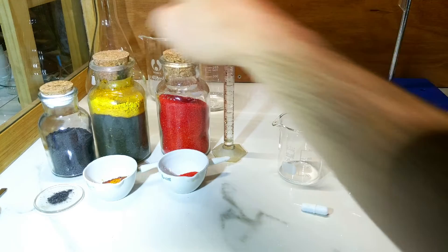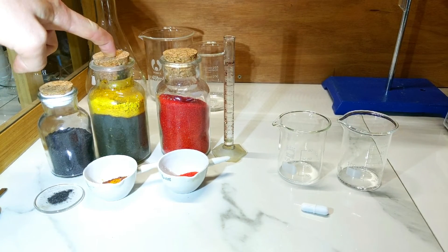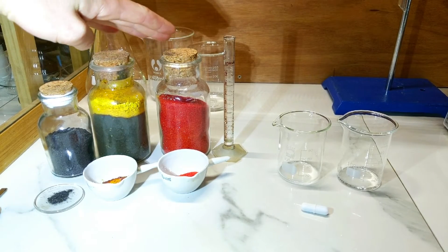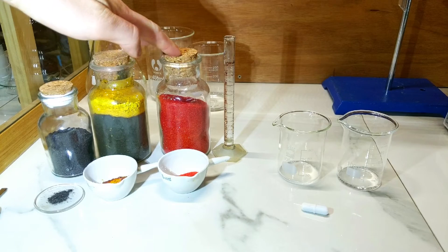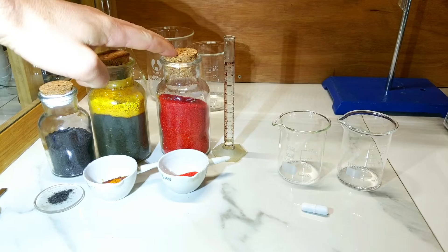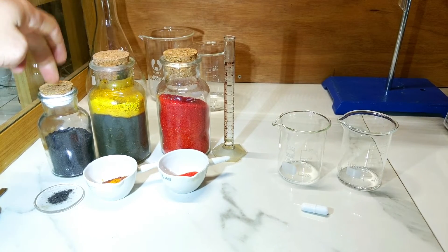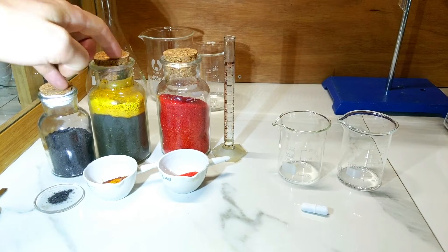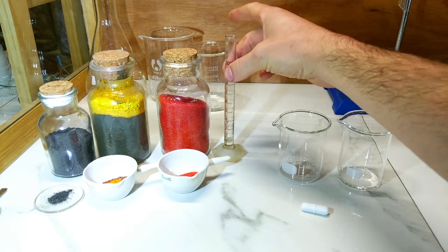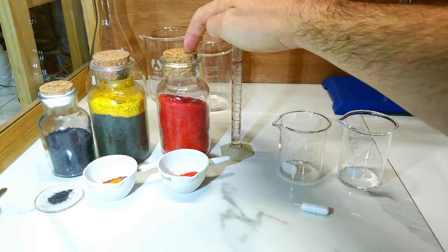There are some iron filings here because the ferric chloride needs to be reduced to ferrous chloride in order to work with the potassium ferricyanide. If potassium ferrocyanide were available, it could be mixed directly without reduction. We also have 1.5 mils of hydrochloric acid which will be added.